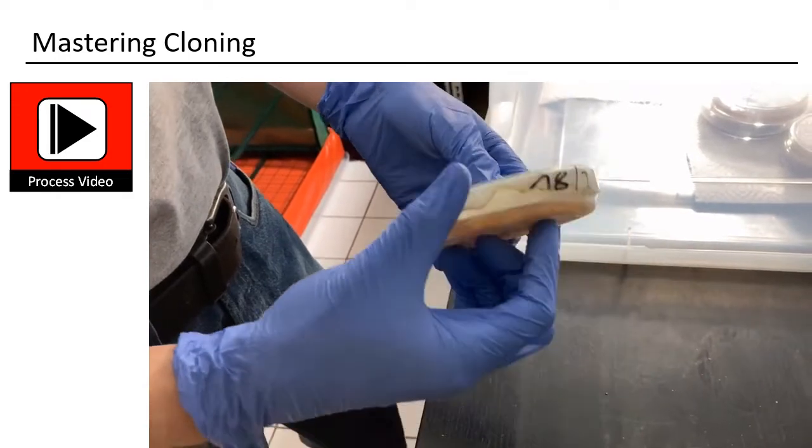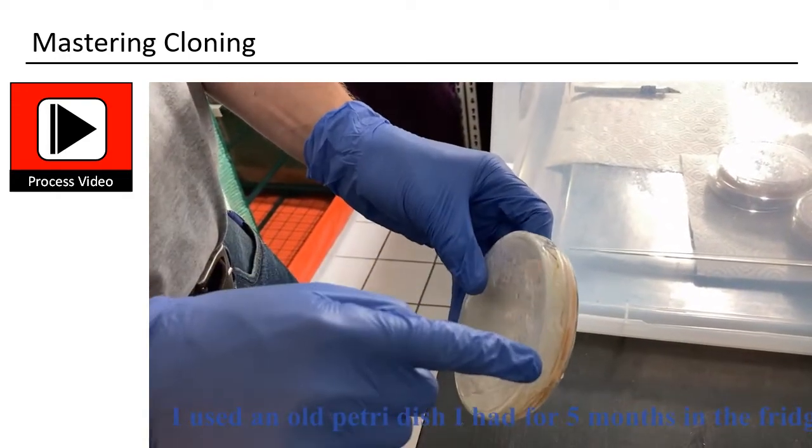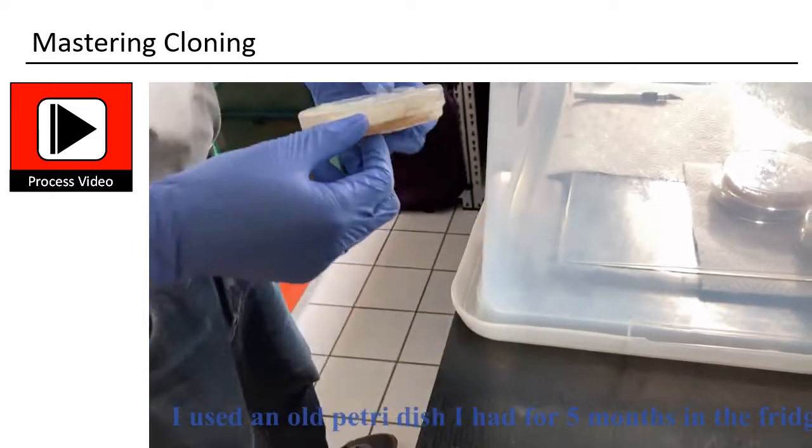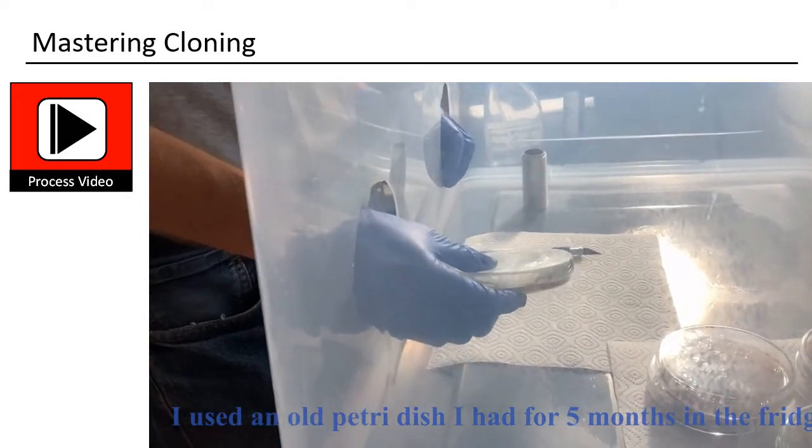I used an older petri dish. Normally they are easy to open. If you put a little piece into a new petri dish, only open it a little bit, so that you can put the knife in.